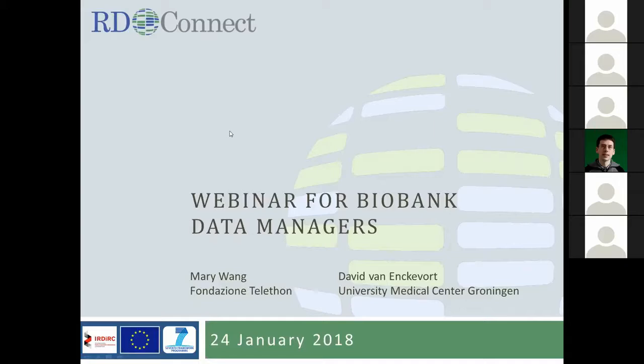With me today presenting this webinar is David van Enckevort. He's a project manager at the University Medical Center of Groningen in the Genomics Coordination Center in the Netherlands. And so in RD-Connect, he's also in the work package developing biobank IT tools. He's also responsible for several biobanking projects, also in BBMRI-NL and BBMRI-ERIC for biobank directories. So he's our biobank IT expert.